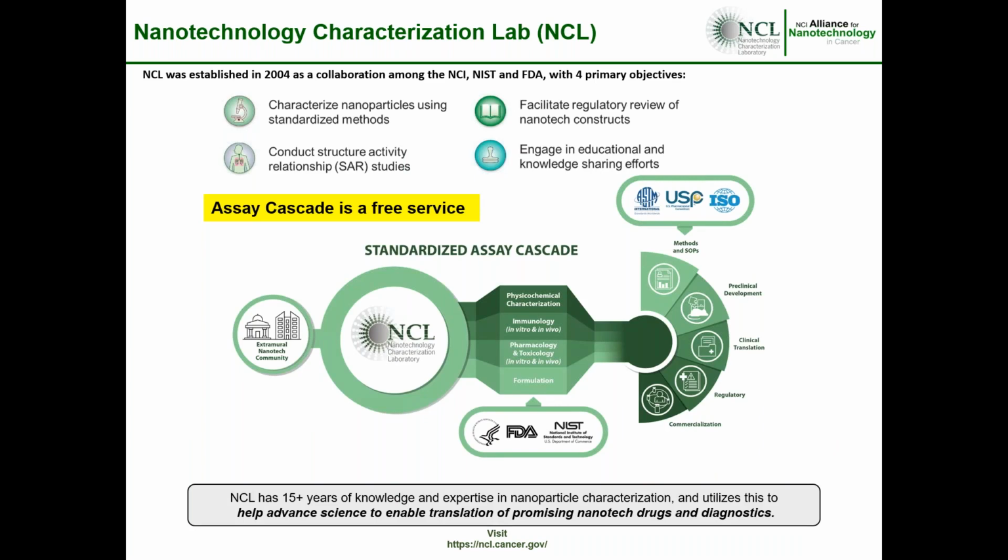The Nanotechnology Characterization Laboratory was established in 2004. It's a collaboration amongst the NCI, NIST, and the FDA. We have 4 primary objectives: to characterize nanoparticles using standardized methods, to conduct structural activity relationship studies, to facilitate regulatory reviews of nanotech constructs, and to engage in educational and knowledge sharing efforts.